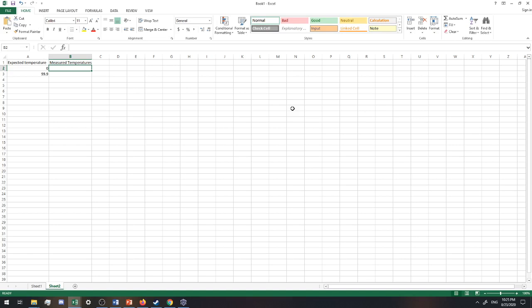Then you make some measurements in class. So those are going to be the things your thermometer tells you. So my thermometer tells me that when I put it in the ice, it's actually 1.5 degrees, it thinks. And then let's say it said my boiling temperature was 98.5. You may get different things. This is just what I'm saying I work with my data.